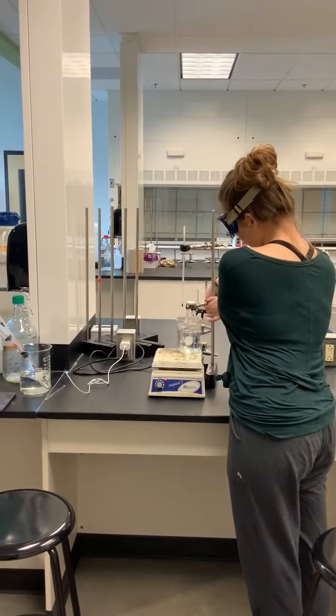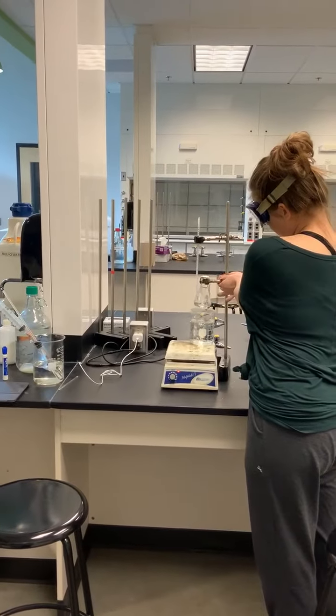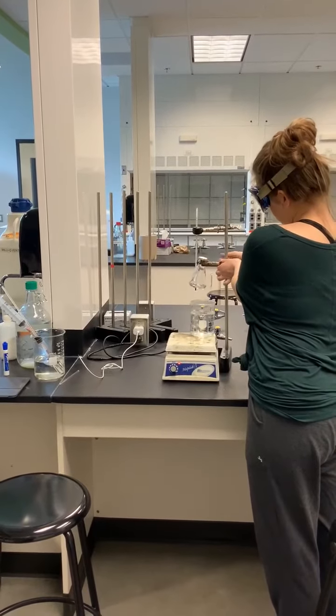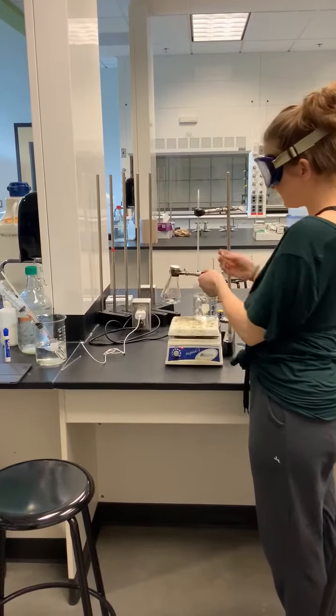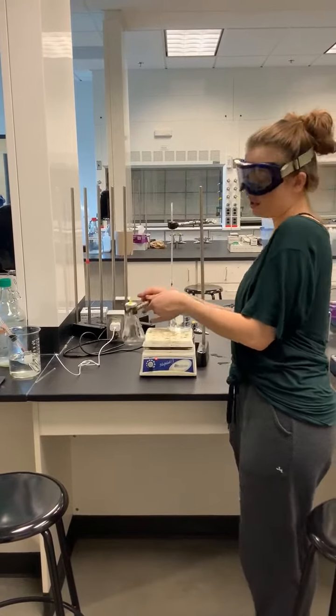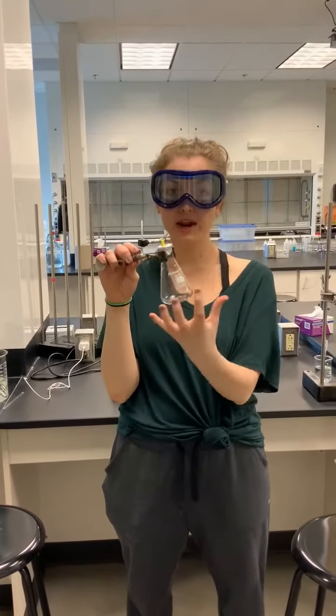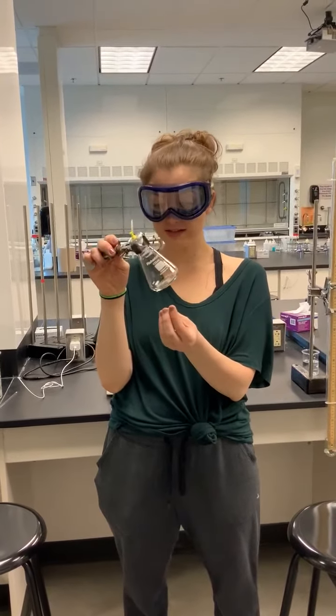Alright guys, we have had this in the boiling water for a few minutes, so I'm going to lift it out and place the tap back on top like this. This is going to help all of that volatile liquid that has spread out in the Erlenmeyer flask to re-condense.